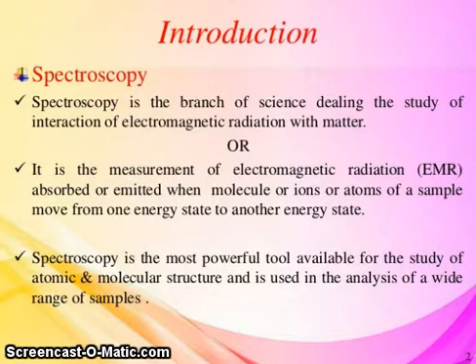So today in this video I am going to discuss spectroscopy, especially spectrophotometry, the UV visible spectrometer. So friends, you know the meaning of spectroscopy. Spectroscopy is the branch of science dealing with the study of interaction of electromagnetic radiations with matter.